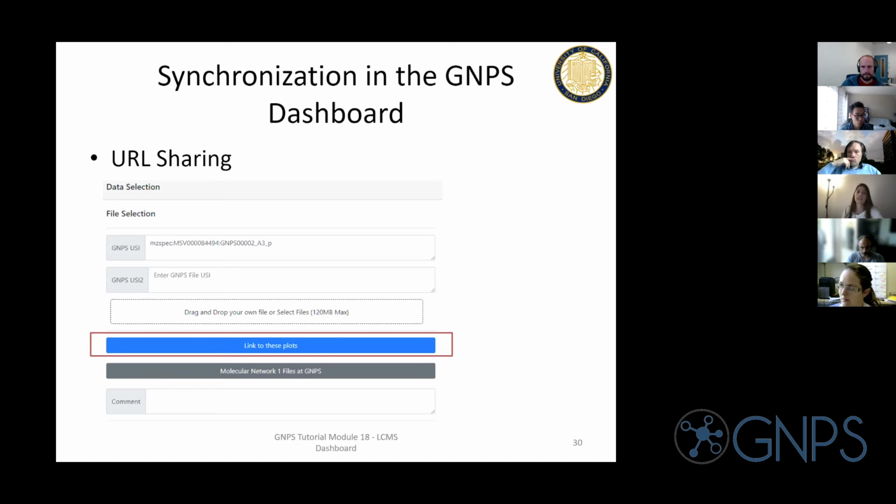And so that's one of the uses that we think could be helpful. This is a way to generate a link that you can share with others, share with social media, share with yourself, or share with your PI. That's also really cool because as you're doing analysis, you can just share with your PI. Yeah, force them to look at data too. I know they miss it.